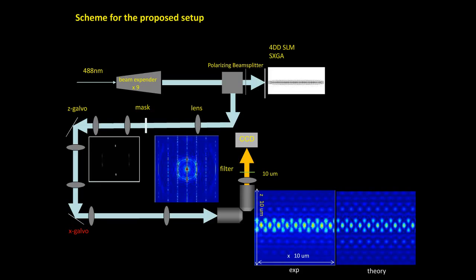And then we conjugate this pattern to the excitation. And these two excitations, as we see, are opposed. They are orthogonal to each other. And this is the point spread function that we can get from the optics, from the microscope. The right one is the theoretical calculation, and there is the experimental data. As you can see, they match pretty well.